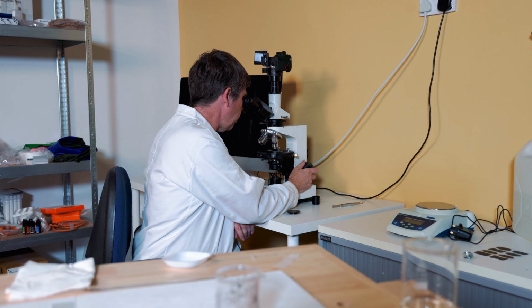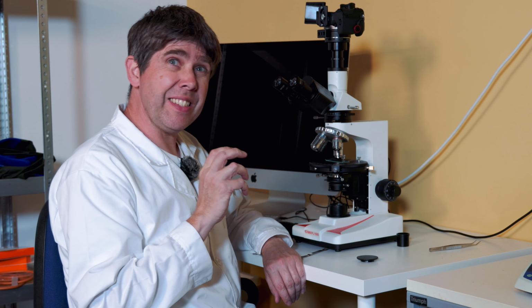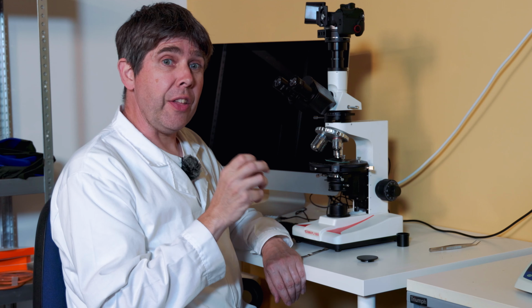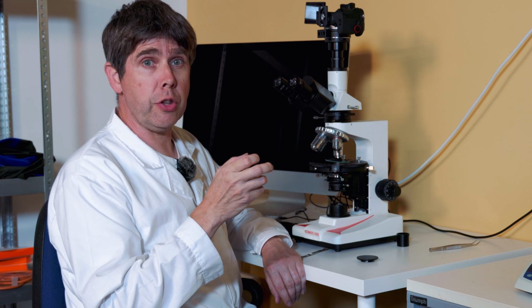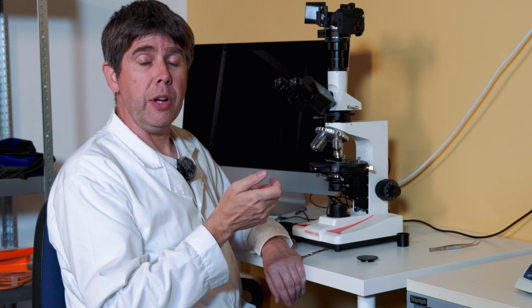Looking under the microscope, we can clearly see small particles in the first sample. The other 2 samples, I wasn't able to find a single particle with my microscope here. So I think we can conclusively say that that first one that filtered quickly did so at the expense of allowing particles through that ideally we would rather had not ended up in with our filtrate at the end.